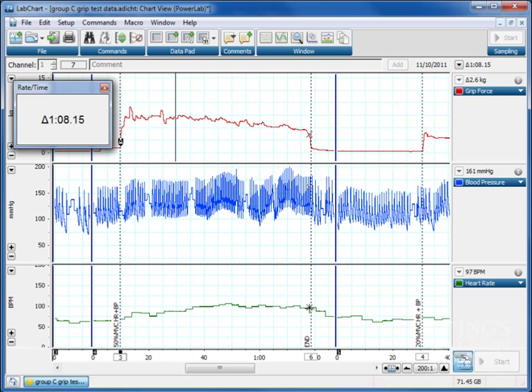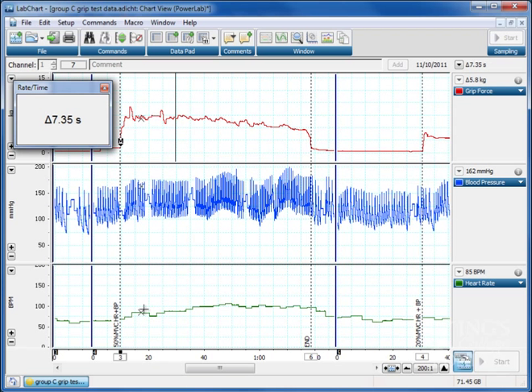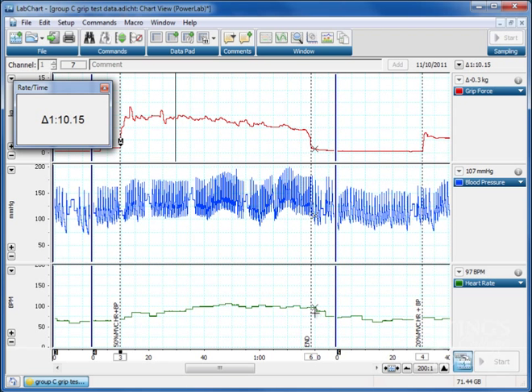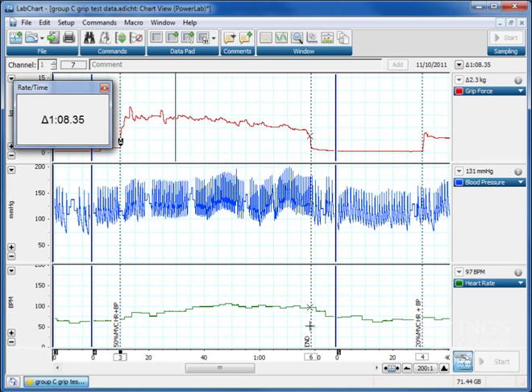So to get a true representation of the changes over time, you can put these data into bins, so sections of a finite amount of time, let's say five or ten second sections, and then plot the data from the five or ten second sections. In order to do this kind of binning technique, we can use either the DVM and a lot of maths, or we can use what's called the data pad.